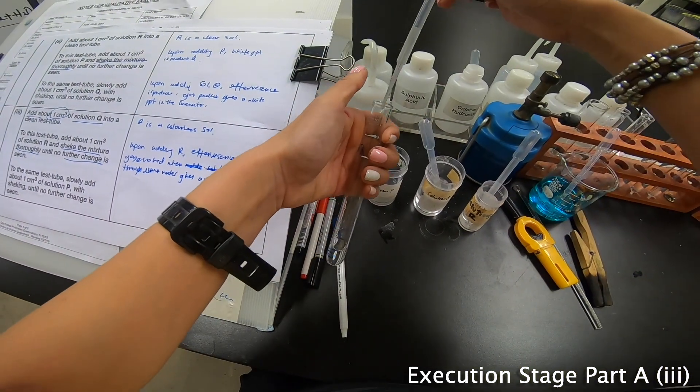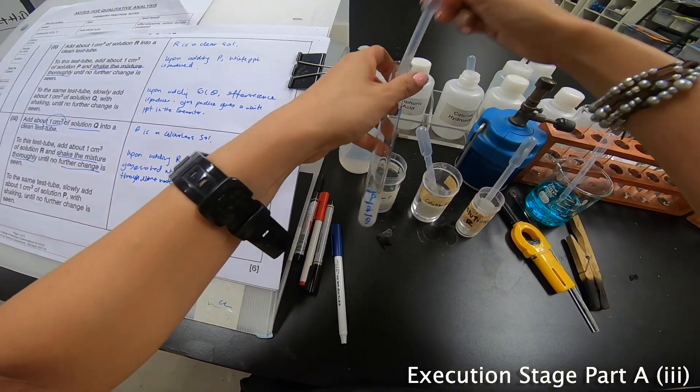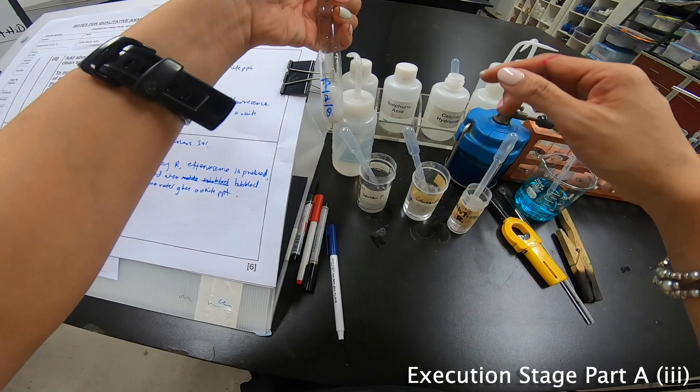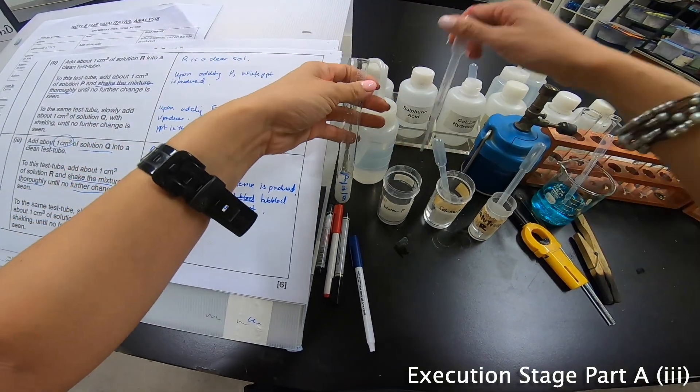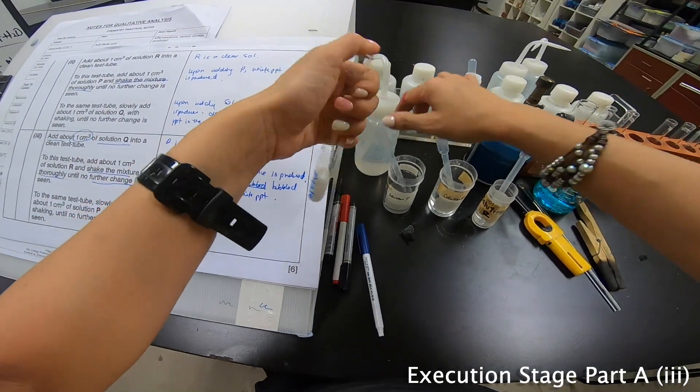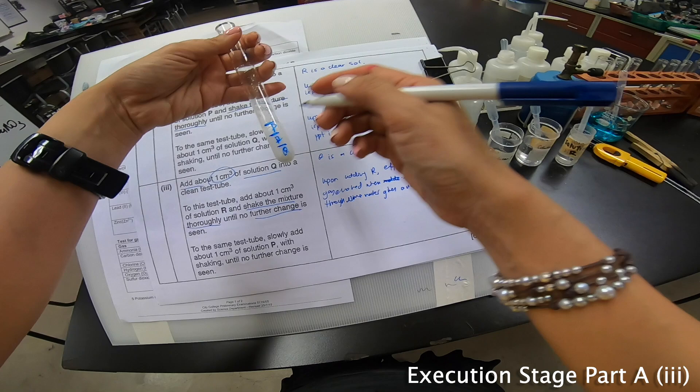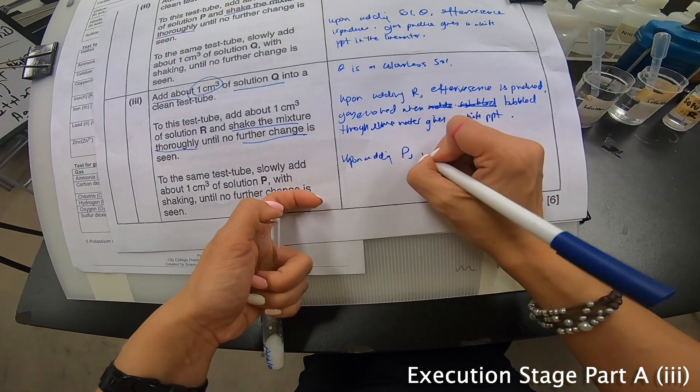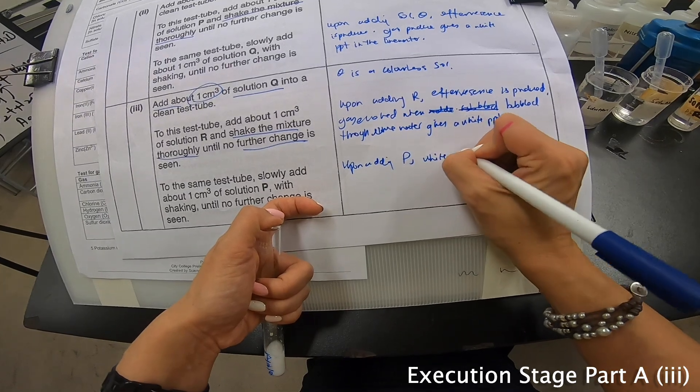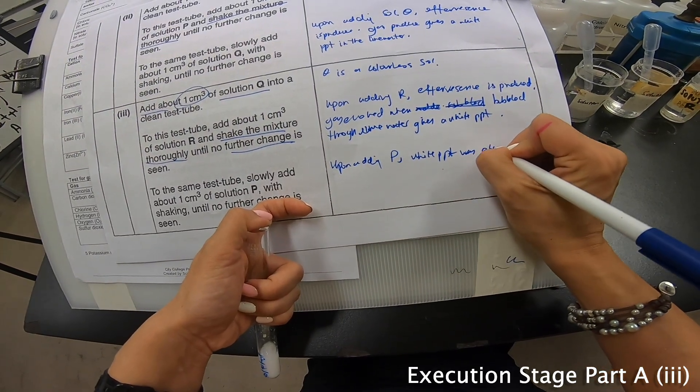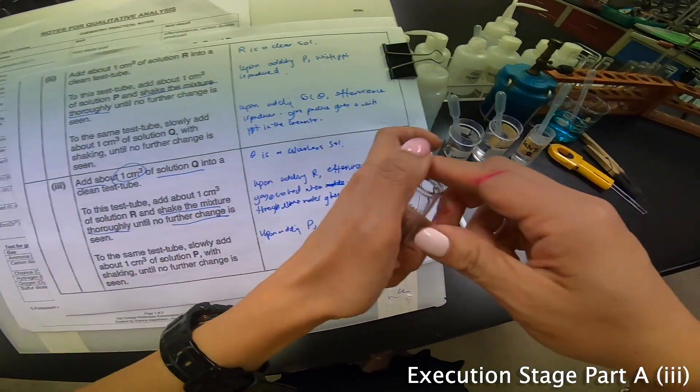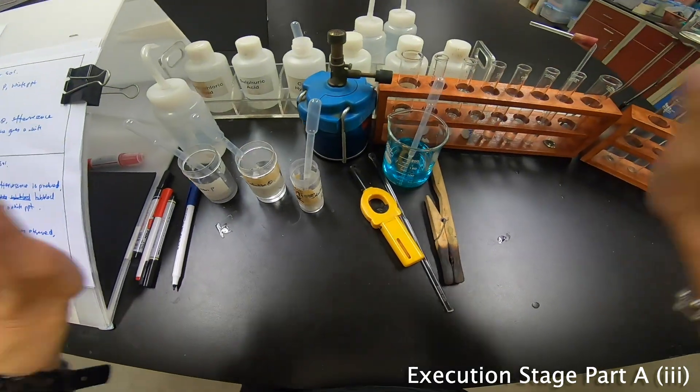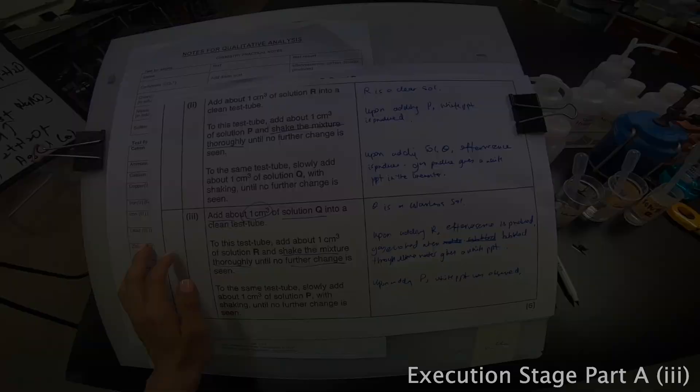Now, right now, let's add P. I can clearly see white precipitate for me. Let me add two. One. Slowly add and then white precipitate is seen upon adding P. White PPT was observed. Let's put this back. So, we have complete the first part already.